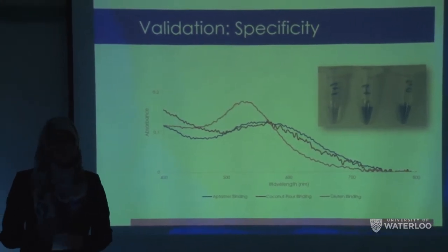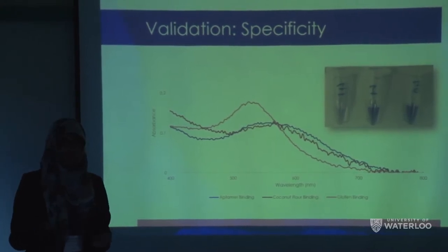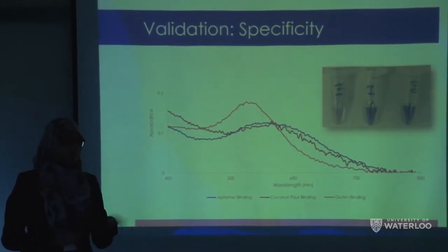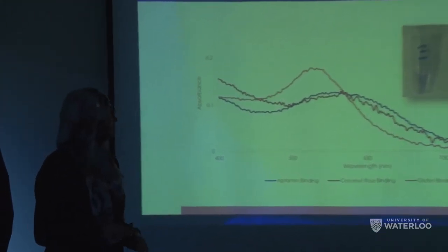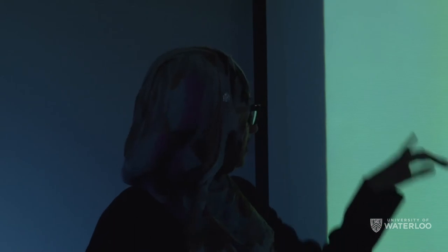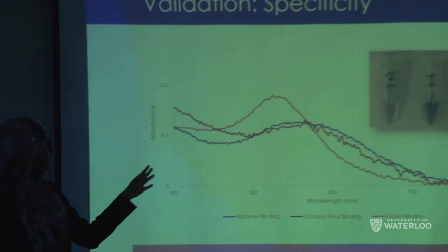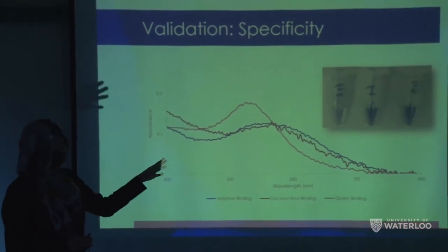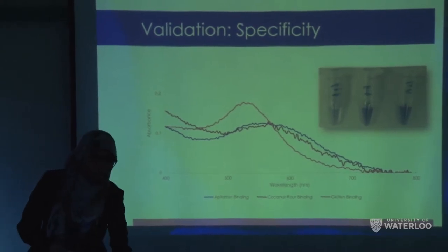Next, we wanted to be able to test our specificity. We wanted to make sure that our gold nanoparticles would not disperse with the addition of just any substance. So we tested this by using certified gluten-free coconut flour. We added the coconut flour under the same conditions, so 20 ppm, and everything else, the solvent it's dissolved in, is the same. And you can see the brown spectra is the coconut flour, and it has very little deviation from just the aptamer-conjugated gold nanoparticles. And you can also see in the picture above, on the very left is the gluten sample, the much paler pink color. The middle is our coconut flour sample, and then on the right you have just the aggregates. So you can see the coconut flour and aggregates don't show much of a change at all.